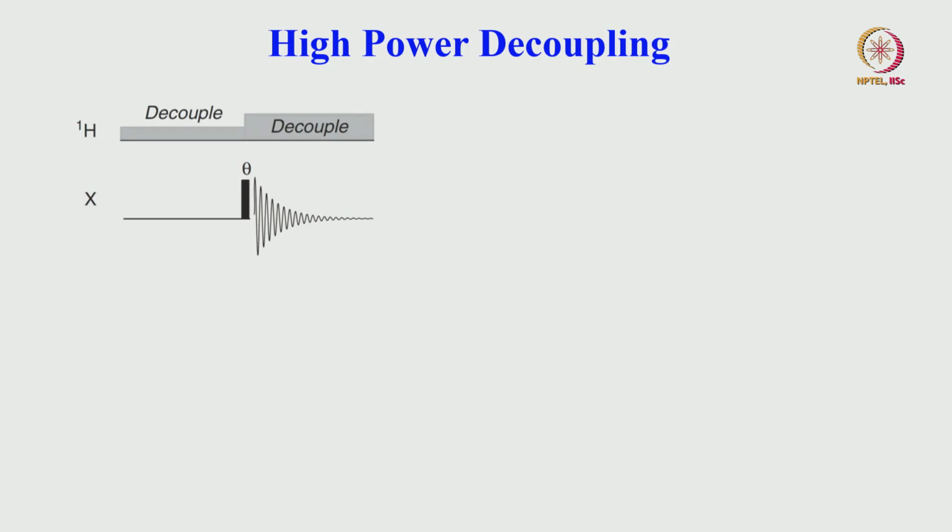I can think of another situation. I can apply continuous RF power, maybe of different strength, or similar strength, no problem. This is called high power decoupling.